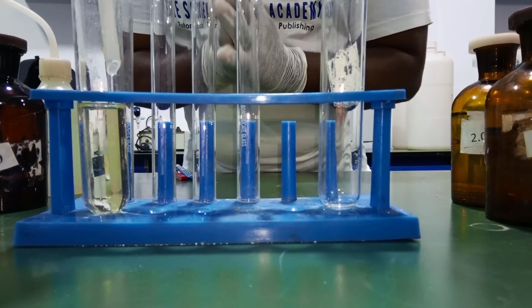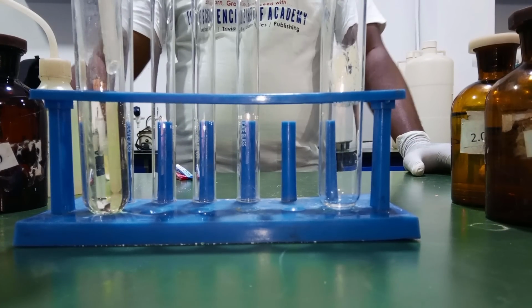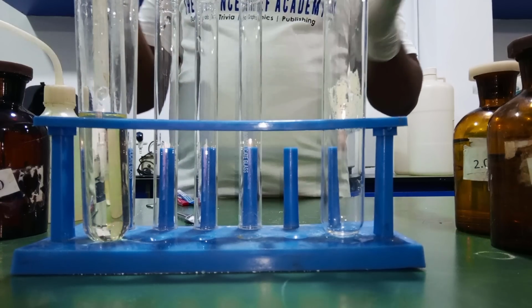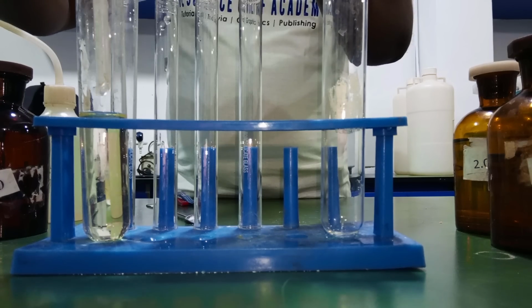Okay, our filtration is almost done. What do you think about chemistry as a whole and chemistry practicals in particular? It's very interesting, right? Let's have your comment in the comment section. All right, I think our filtration is complete. So let's bring it out. You cannot get 100% separation because of time.